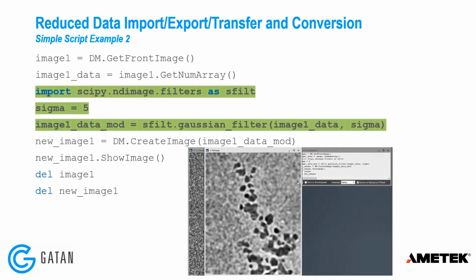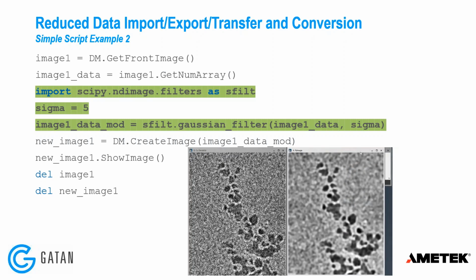And if I run the video here, then there we go. I have my blurred image. And this might be a useful first step for some types of processing. Maybe if I want to reduce the amount of noise in the image before thresholding to determine particle size, or maybe particle tracking, that sort of thing. But a very simple example with just 3 lines of code.